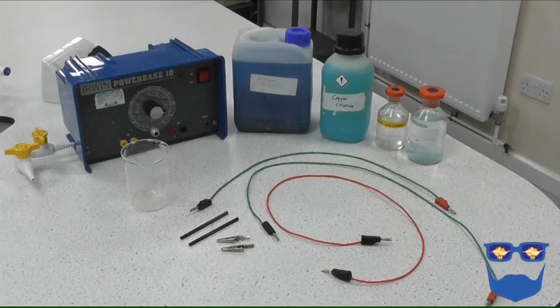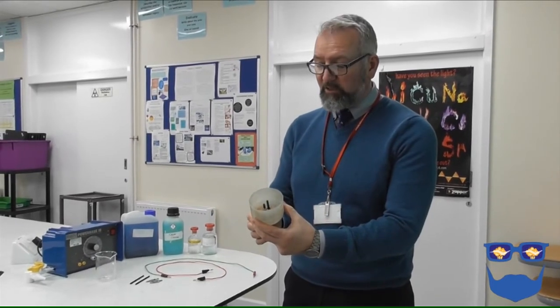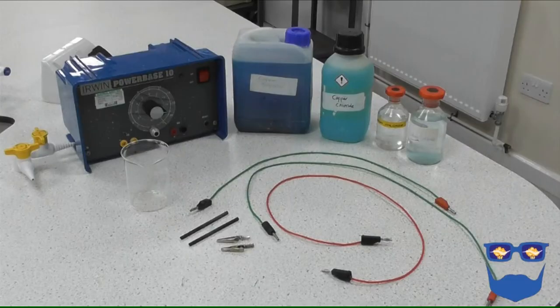Setting up the experiment and what to look for. We need to be confident with the names of the equipment and the procedure. The equipment we will need: a power supply, leads, a 250ml beaker or a Nelson cell. Here's an example of a Nelson cell and it is just like your electrolysis cell but the cup has been done for you and the electrodes are sticking through the bottom. 2 graphite electrodes, crocodile clips and the 4 aqueous solutions.